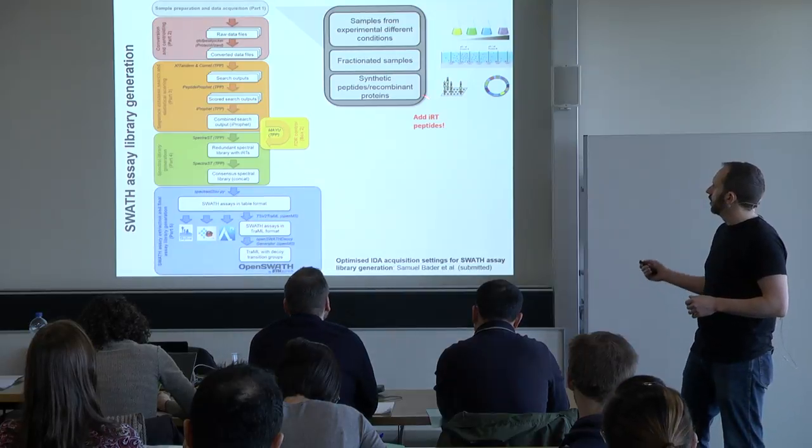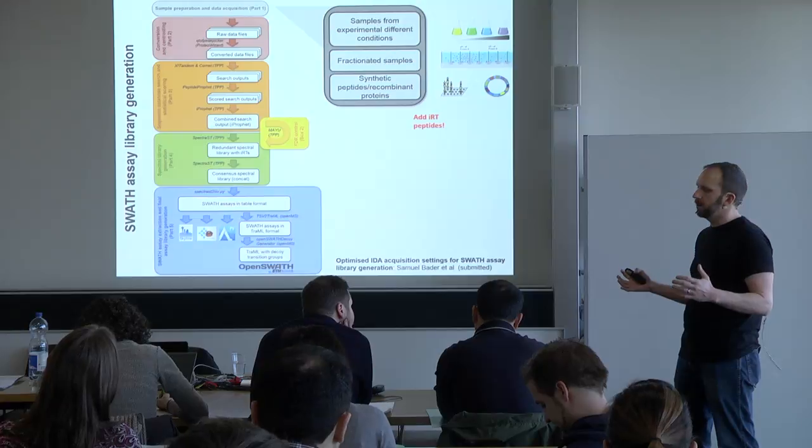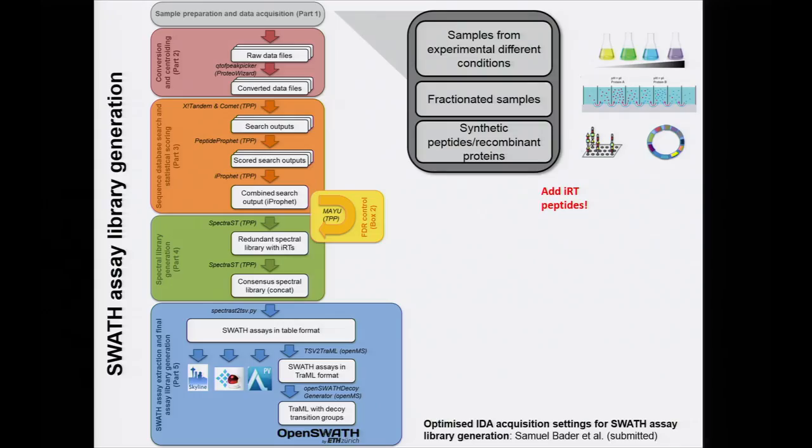Adding iRT peptides, some kind of standard peptides to normalize the retention time space, is valuable. I think Ariel talked a lot about this in depth.